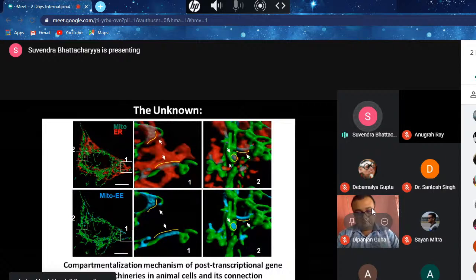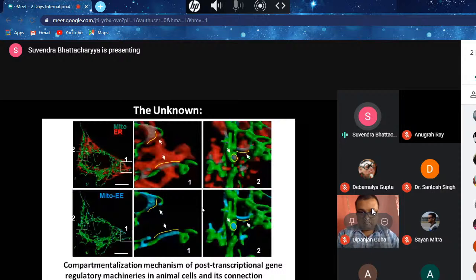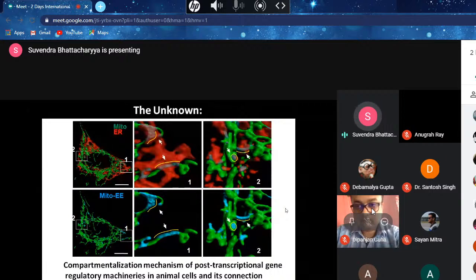So we always look forward to new techniques and new tools that allow us high-speed imaging. Here we had a microscope capable of multi-channel high-speed imaging with more or less high resolution, but that resolution is not as great as we would like, and that will be taken care of in a new platform that we're talking about, these structured illumination microscopic techniques that will allow super resolution imaging without compromising the speed of image capture.